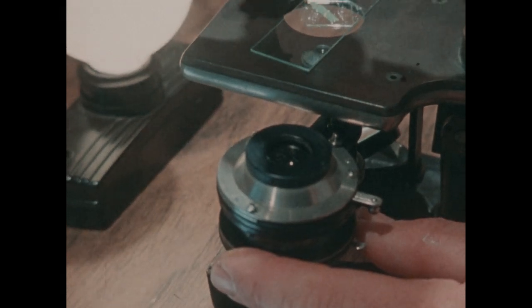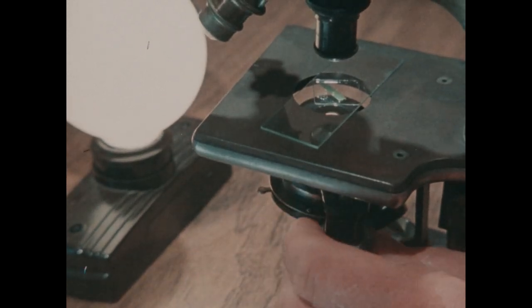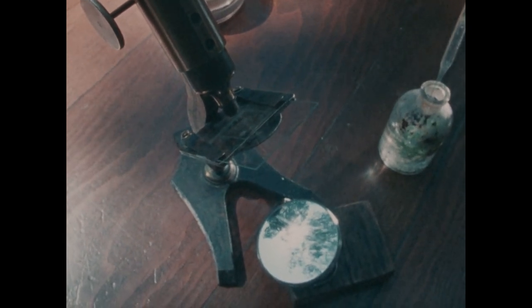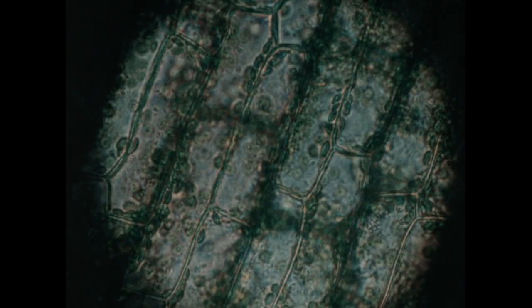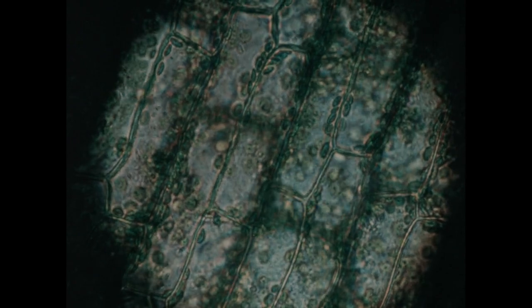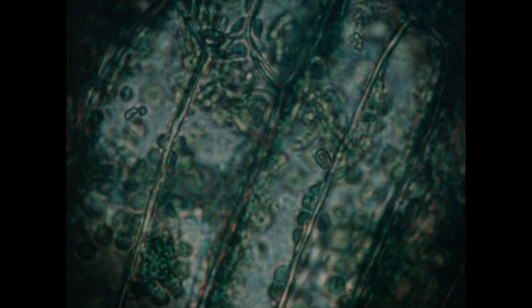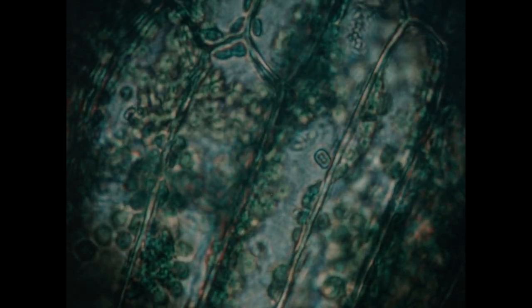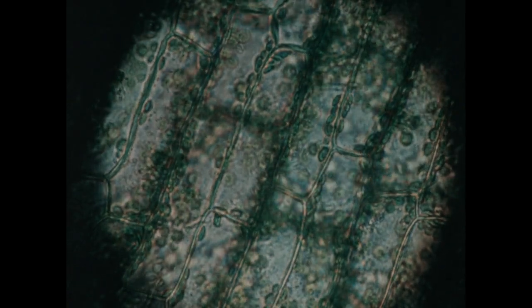Light may set an ultimate limit, but the condenser lens has a much more immediate effect on image quality. Before condensers were used, illumination was by mirror alone. In this kind of condenserless imaging system, leaf cells look grainy and structures blend together. Changing to a higher power objective gives no more information, just the same information enlarged. The problem here is poor resolution, the ability of an imaging system to separate or resolve details.